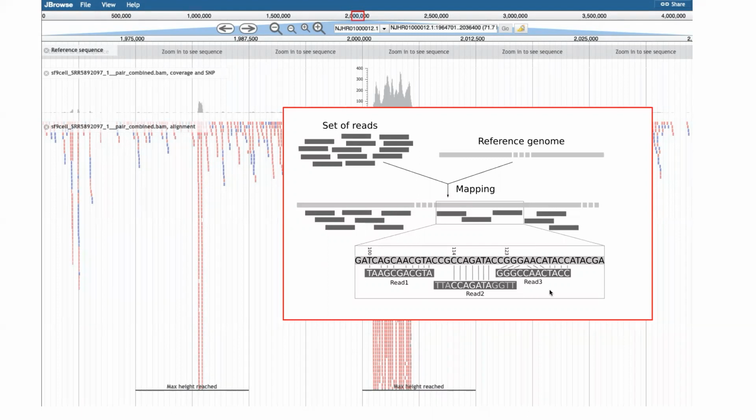So here you can see that by matching the sequence, so the T to T, A to A, G to G, C to C, etc., and allowing for some flexibility. For example, A to C doesn't match, but because so many of the other ones do match, we say that this aligns to this portion of the genome, and we can accurately estimate the position, the beginning and the end of either the mapped portion or the whole read.